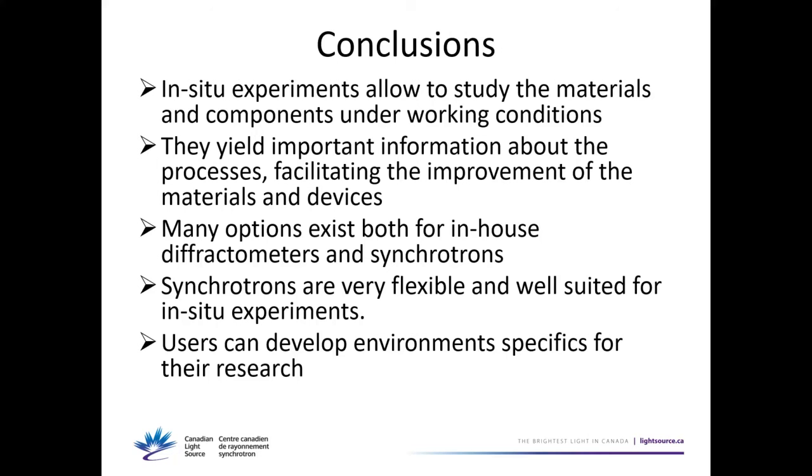In absorption, so we have had, I'm not sure if I understood the question. Were there absorption experiments? High pressure hydrogenation absorption. High pressure. Okay. You just need to flow hydrogen gas over it as you're taking diffraction. Yeah, we can do that. It has to be a low concentration of hydrogen, like forming gas. Because we don't have a process.